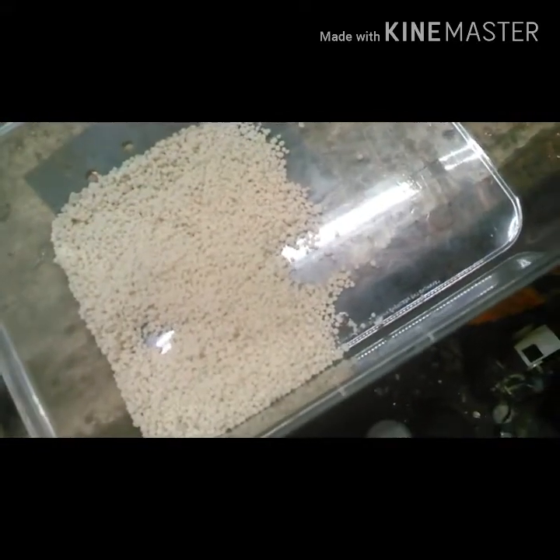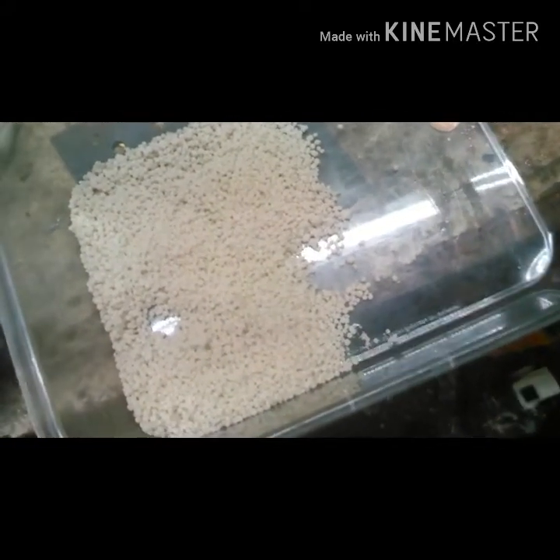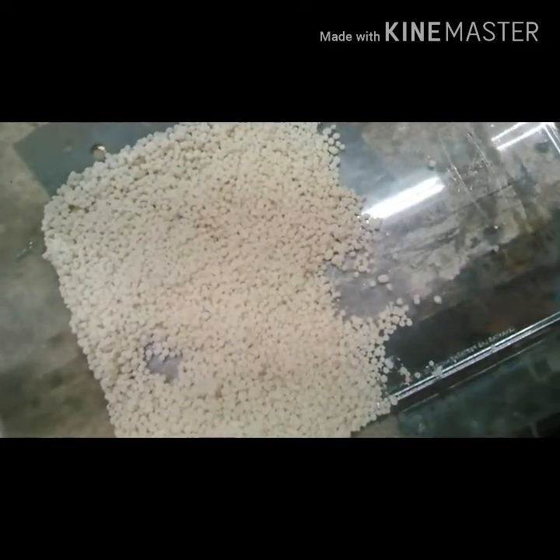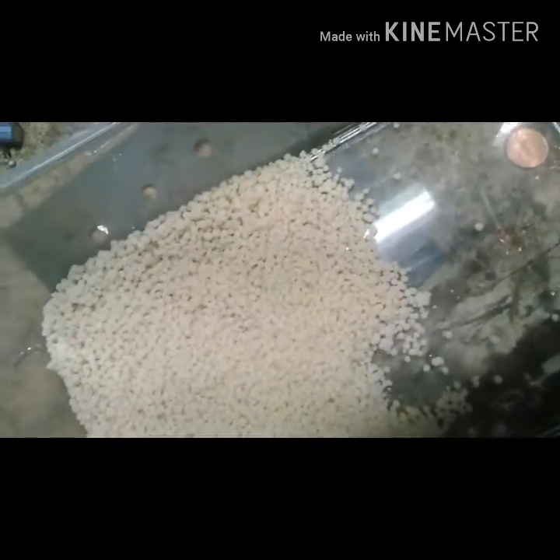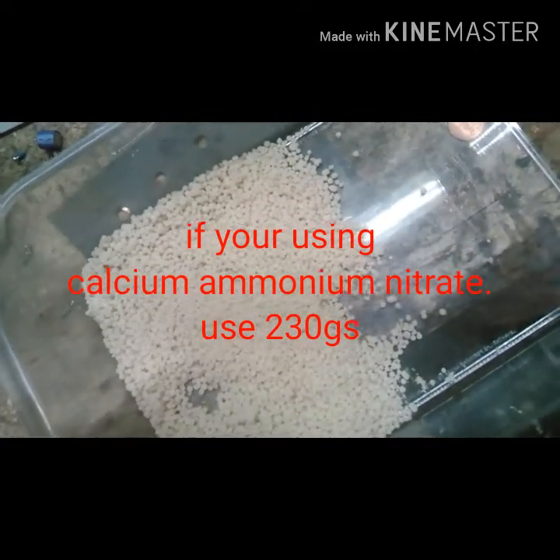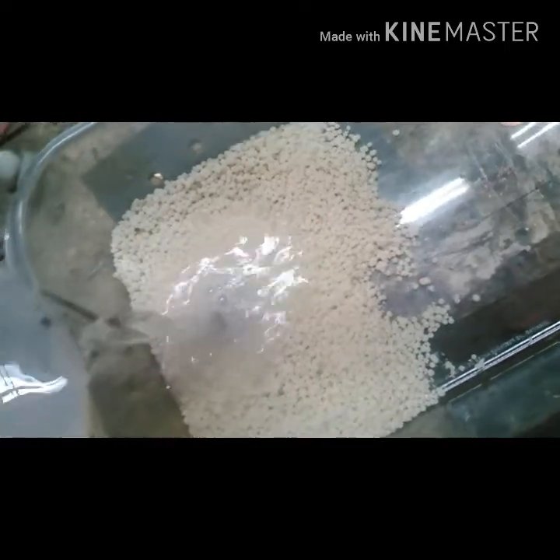What you see here in this tray is 170 grams of ammonium nitrate. We're going to add 400 milliliters of water, which is going to put off an endothermic reaction. Put your water in here and then stir it up till it's completely dissolved.